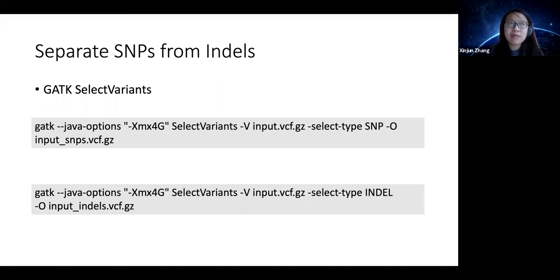For example, if you study population genetics questions, a lot of times just using the SNPs is enough to tell you whatever story you're interested in. And indels is a more interesting story because there are structural variants, and more uncertainty related to whether or not this is a true call or what exactly we can do with this indel information.